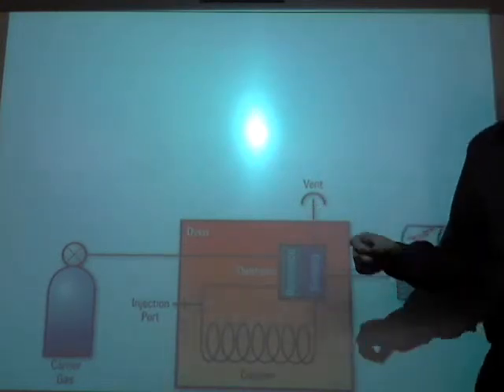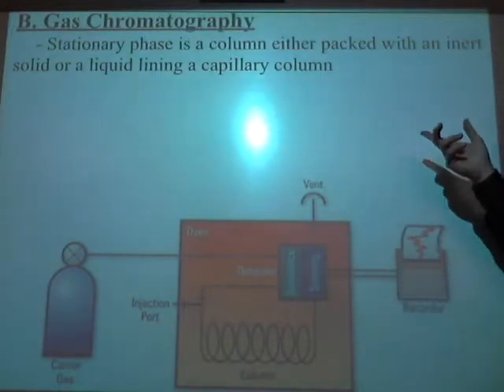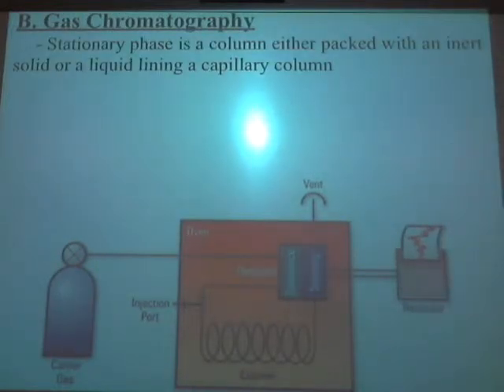Anyway, let's go over gas chromatography. Gas chromatography, as it just showed you, the stationary phase is a column. It's a wire or a hollow column packed with either an inert solid or a liquid lining the capillary column. Usually it's a solid.